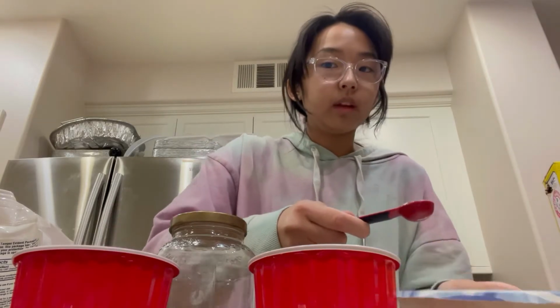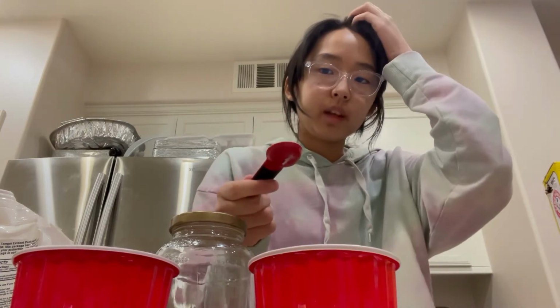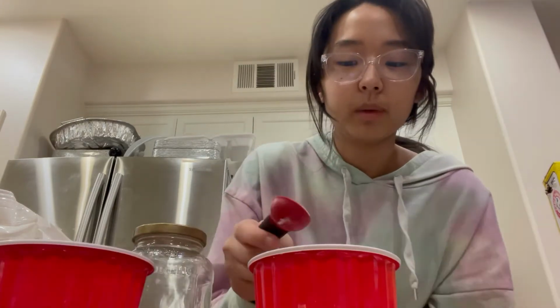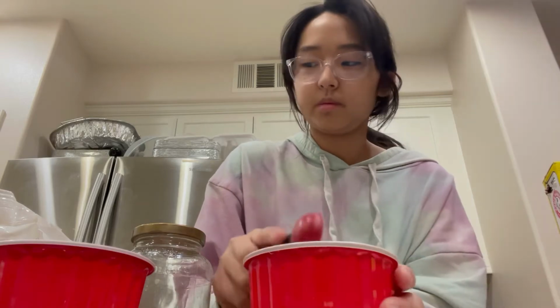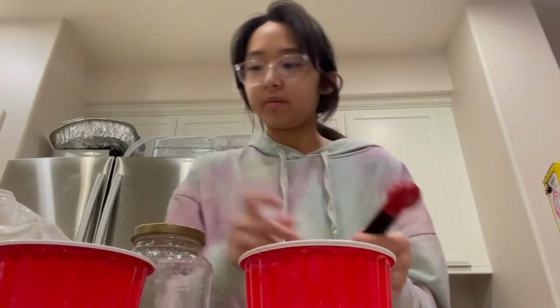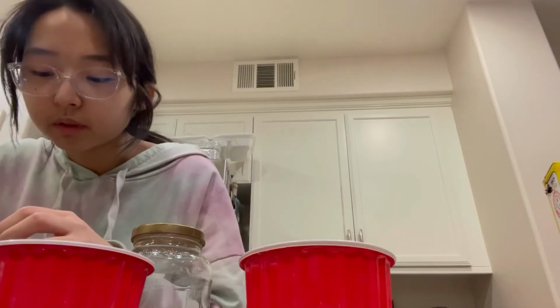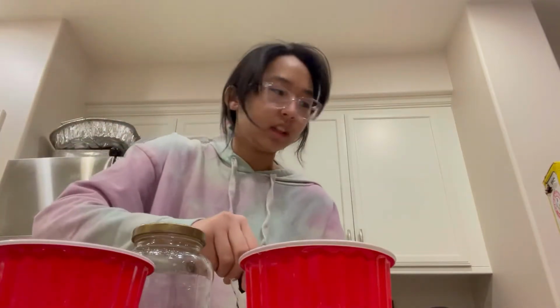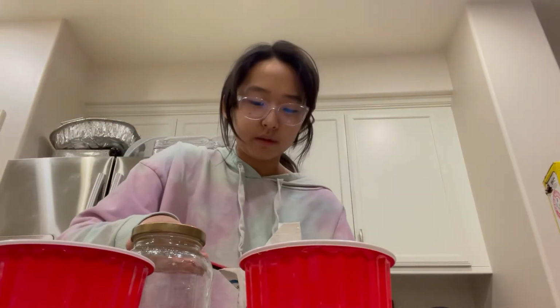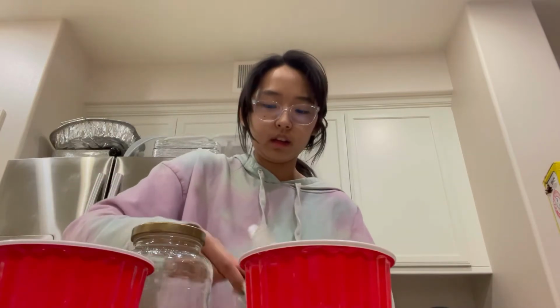While I am letting both of them dissolve, I will explain what is happening, like why the precipitate is forming. Also, I'm trying to be very careful to not get anything on my hands, and be very safe. I do also have gloves here, which I might use a little bit later.